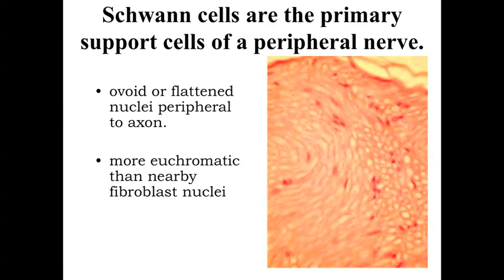It's important to keep in mind that the other thing that these nuclei could be associated with are fibroblasts. Schwann cells are the support cells within the peripheral nervous system. Fibroblasts are essentially the connective tissue cells, providing the connective tissue covering for the structure. In general, fibroblast nuclei are going to tend to be very heterochromatic — darker staining and more flattened — where the Schwann cell nuclei are going to tend to be more ovoid and more euchromatic, paler staining. You're also going to see the Schwann cell nuclei towards the core of a peripheral nerve, and the fibroblasts in the connective tissue regions around the nerve.